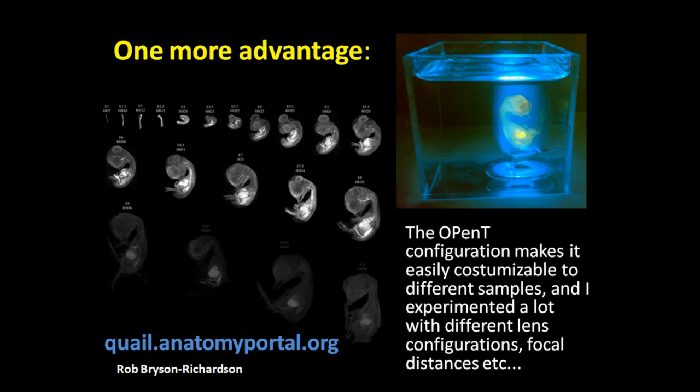Like this embryo that you're seeing here, you see the green fluorescence as blue light shines through it. It's all embedded in BABB, the clearing agent. And notice that you can actually see through it. It's transparent. It's almost like an X-ray, which you can do with visible light after you've cleared the embryo. The embryo is inside an agarose block. You can see it scatters blue light here, so you can see a little bit of the agarose, but once the camera captures it, and it's filtered out by the emission filter, you don't see it anymore.